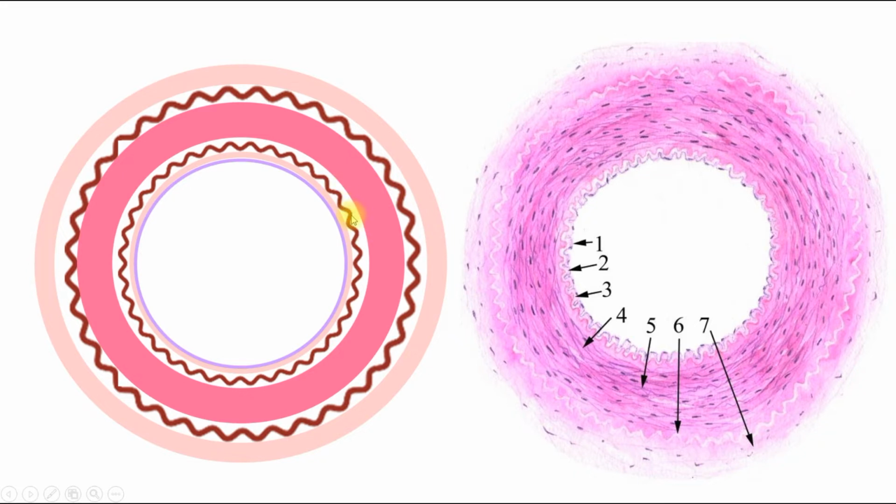And when blood runs through the artery, the wall of the artery may be stretched, and it's provided by the elastic components, elastic membranes. Why are they wavy on these pictures? Because these are usually post-mortem histological slides, and post-mortem smooth myocytes are contracted, and it results in the wavy structure of the elastic membranes because of contraction of the artery. That's why they are wavy. But in the stretched condition, they will be smooth and straight. So it's the general structure of the artery.